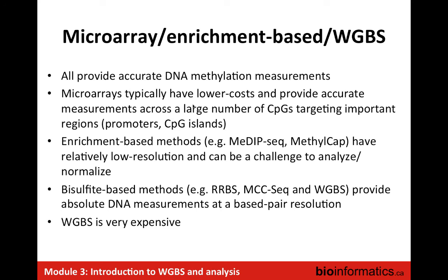But to detect other types of methylation, you really have to use additional or different treatments that are not bisulfite, or that combine with it. There are different assays that allow you to isolate or convert only certain types of methylation marks. There are lots of parallels to what we're going to look at here, but in terms of the treatment, you need to make some adjustments and use other treatments that allow you to isolate other types of methylation. Yes?